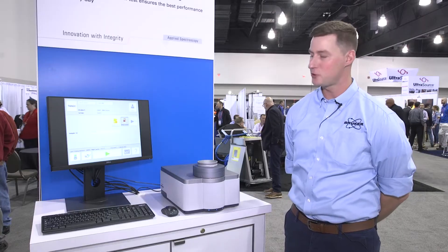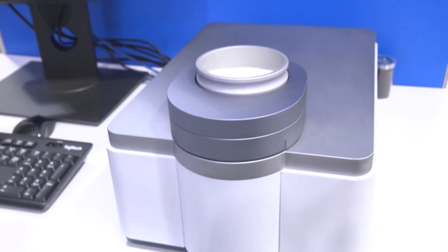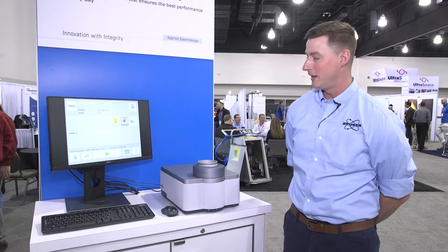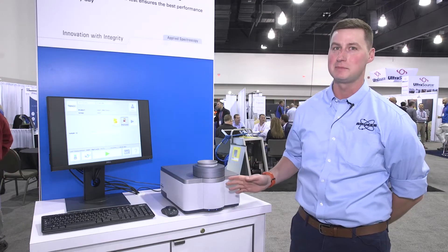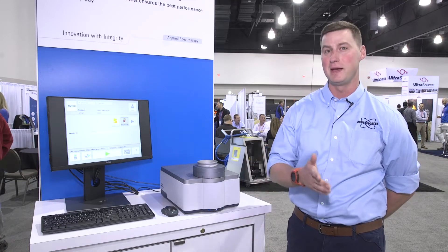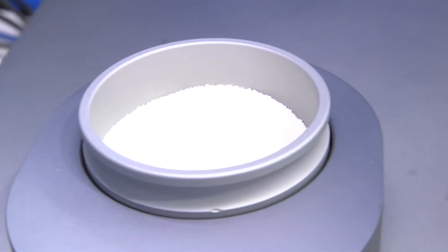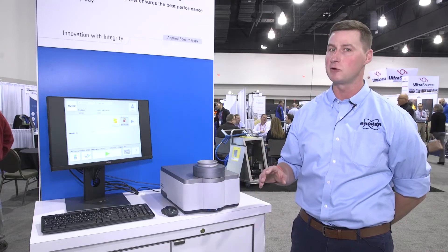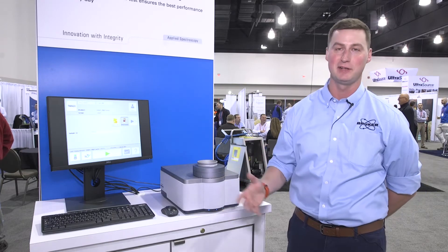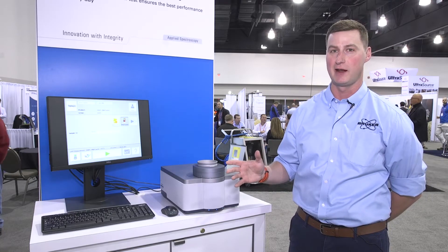This is our Bruker Tango R FTNIR Dairy Analyzer, specifically made for analyzing solid dairy products such as powders, cheeses, or yogurts. It's a single channel system, but it has the same technology as our MPA2 dairy system and the Matrix-F dairy system. That means we're going to have a stable platform that's not going to require biasing or calibration adjustment over time, so you'll have the confidence to run samples and not worry about the predictions you're getting out of them.